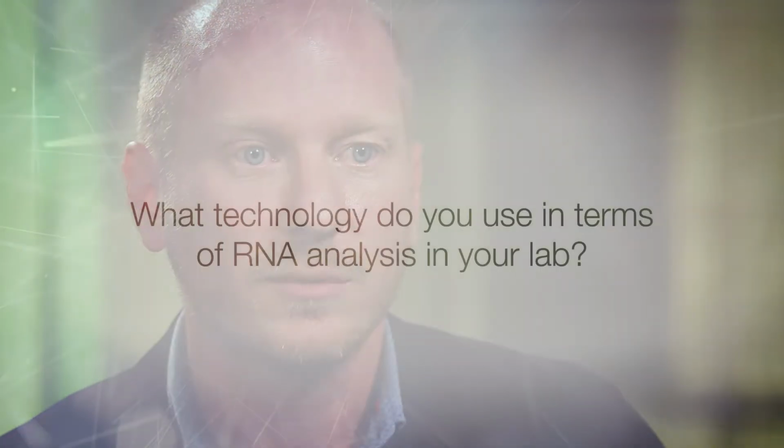And for example, something like the Ion AmpliSeq panel, we're using it quite a lot in cases where people want to look at gene expression counts. And that's a normal thing to do when you're looking at RNA, because then we perhaps don't need more advanced things, like with total RNA that you can get all sorts of information. But using this method, then you can get very good and specific information about gene expression counts.